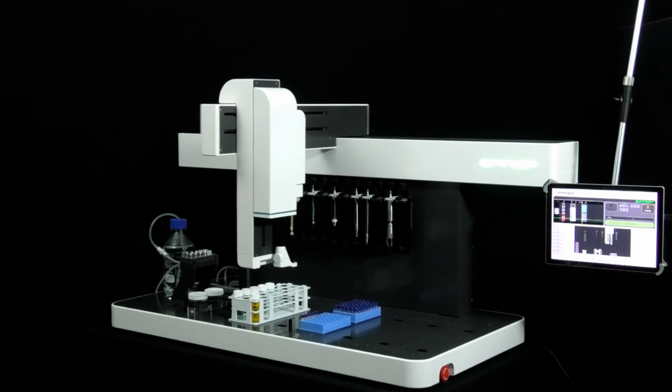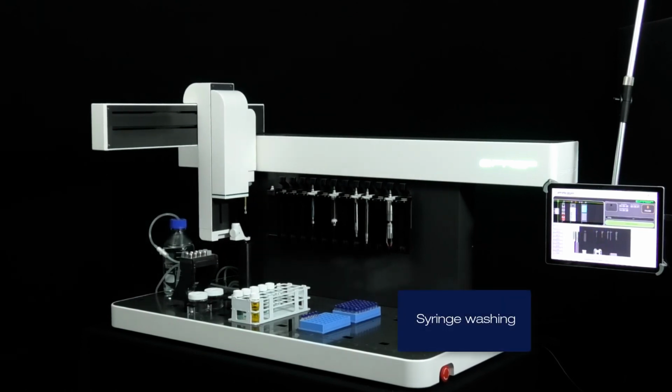The syringe is then washed at the washing station before the next sample.